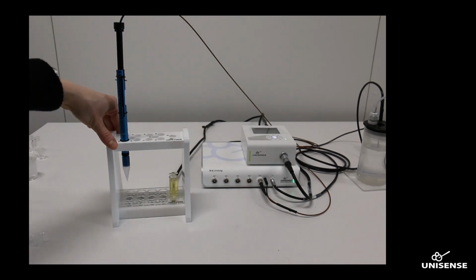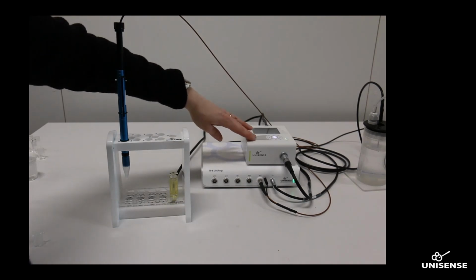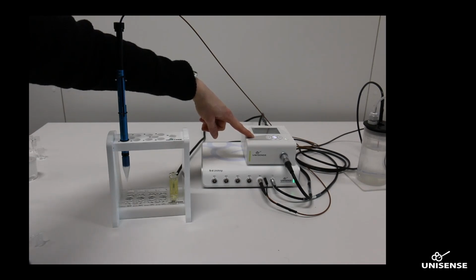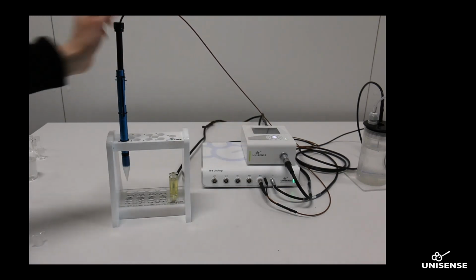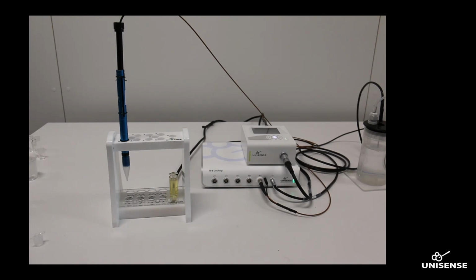The stirring of the rack here is controlled from this box over here. It is the stirrer controller. And over here, you control the speed of the magnet, and you can choose between different speeds, and you can choose between different modes. So you can have the same stirring in all your chambers, and you can also have different speeds in your chambers. So there are different options over there that you can control.